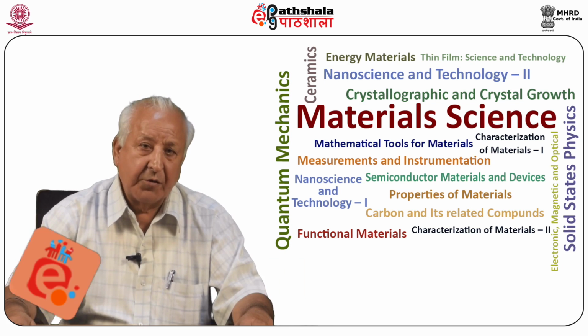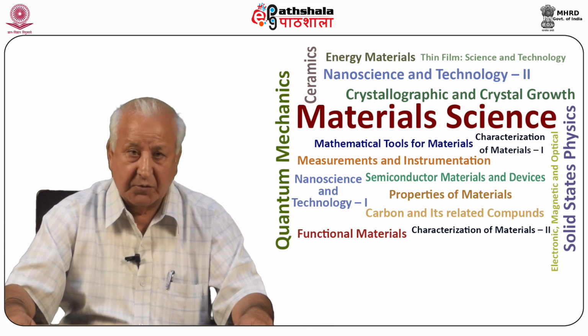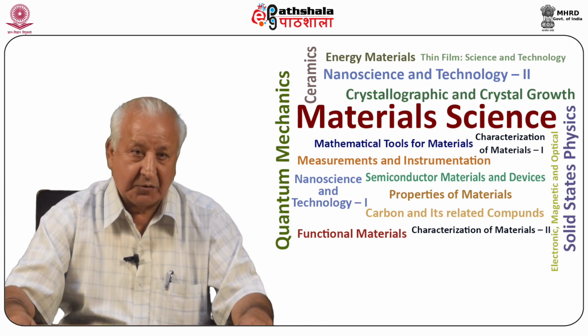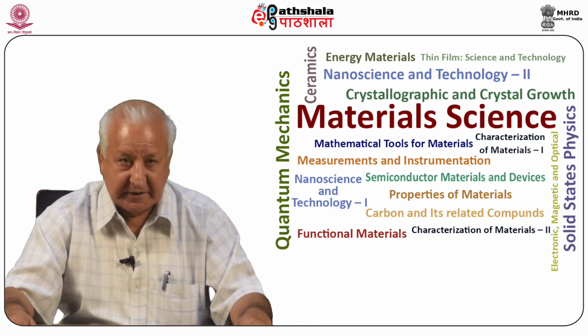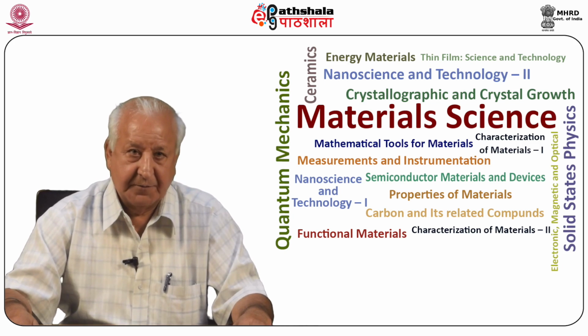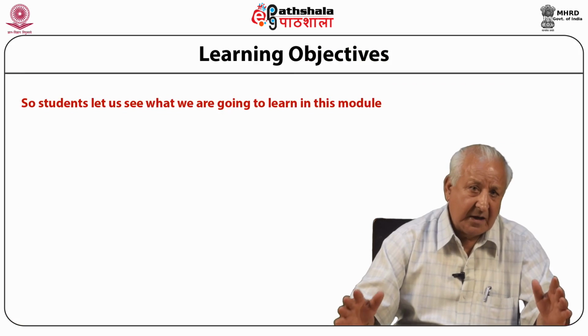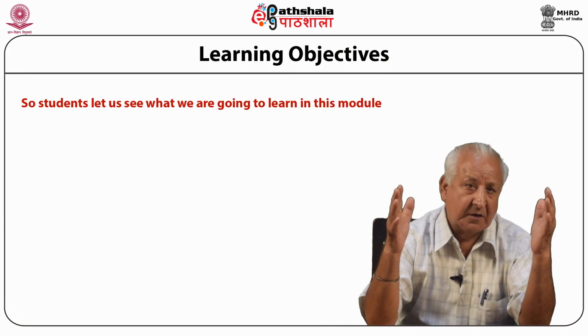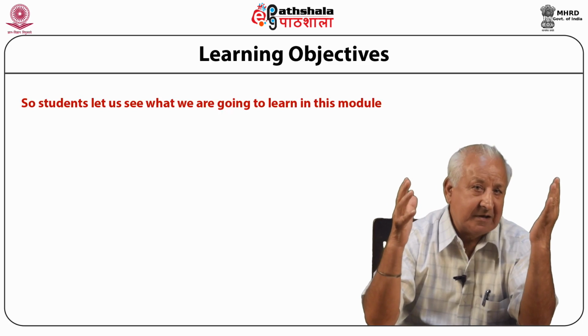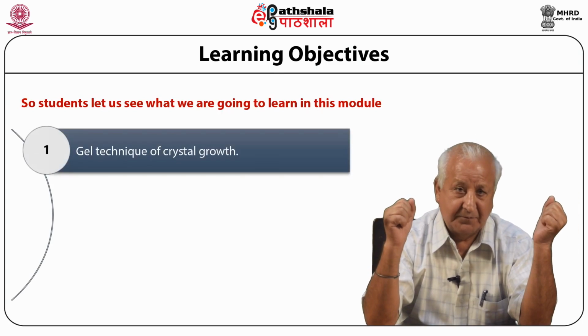Today we are going to discuss a module entitled Experimental Crystal Growth Part 2, that is the gel technique, under the paper Crystallography and Crystal Growth. So students, let us see what we are going to learn in this module. We are going to learn about the gel technique of crystal growth.